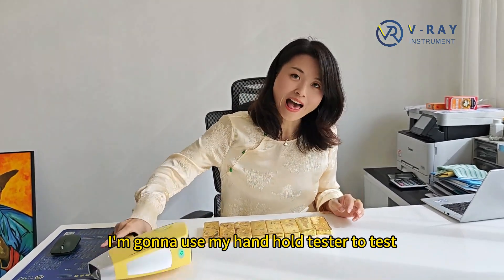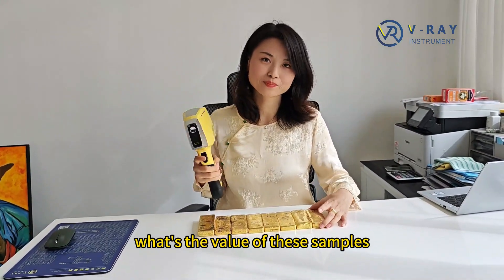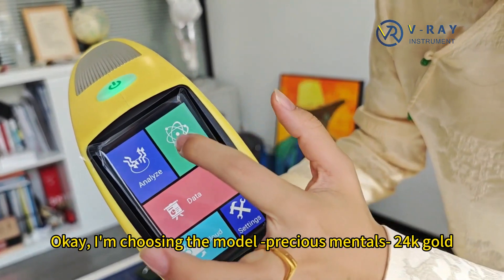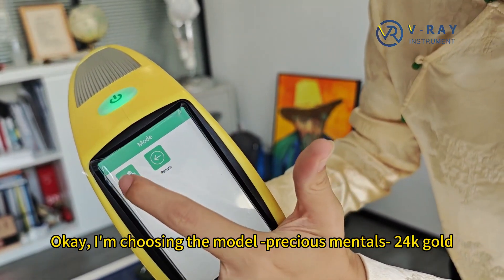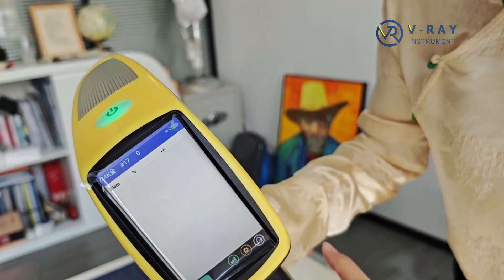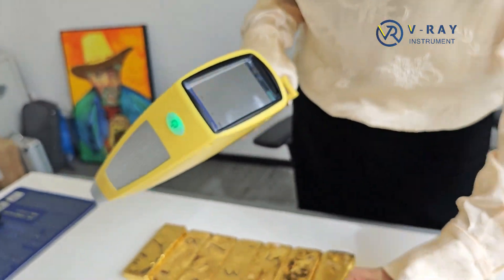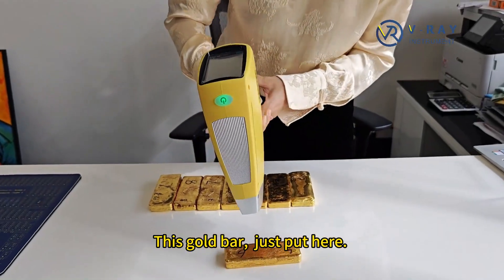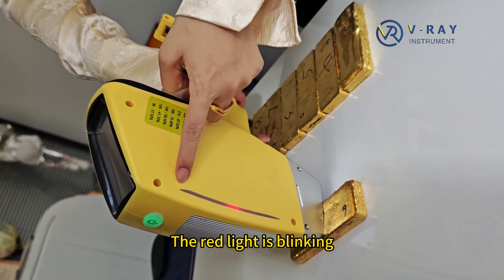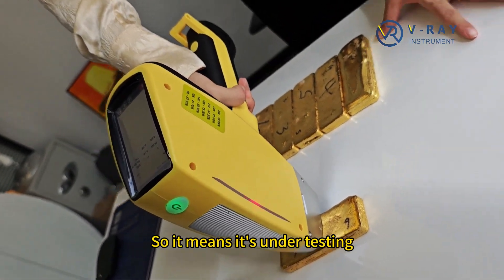I'm going to use my handheld tester to test what's the value of these samples. Take a look. I'm choosing the mode: Precious Metals, 24 karat gold. I'm going to choose this gold bar. Just put it here — it's the tester bottom. The red light is blinking, so it means it's under testing.